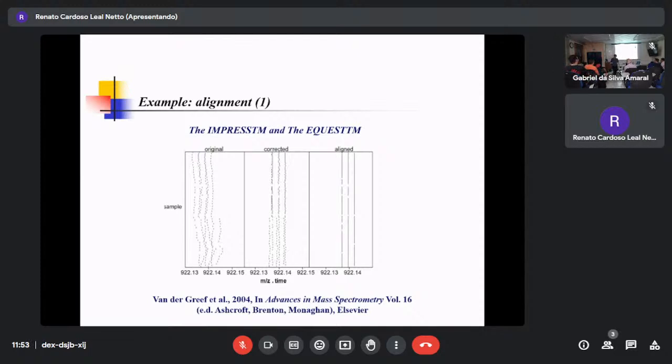So some people are doing alignment. Then I cannot suggest them to use this alignment for animal signals, unless you are using exactly the same variety. Like I measure only orange every time: this orange, this orange, this orange. Then probably you can apply the alignment program.